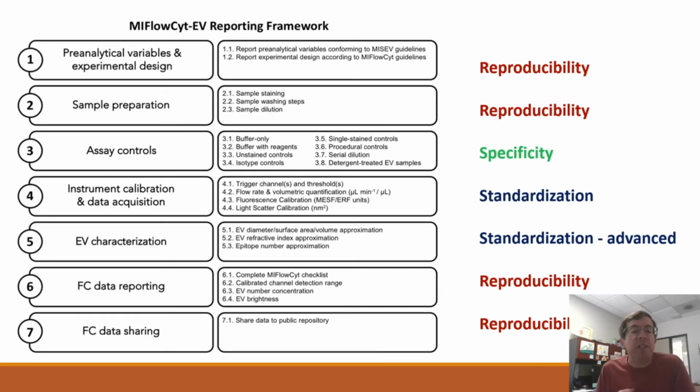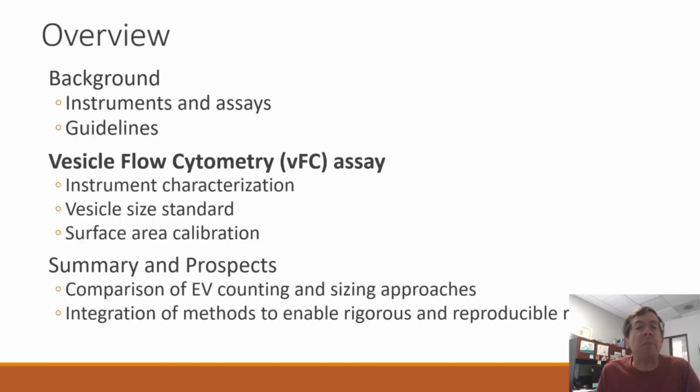And it's that realization that led to the development of this guidelines framework, where all of those aspects that contribute to the measurement of EVs, including the instrument, but also all of the other parts of the assay that are so important, are covered.